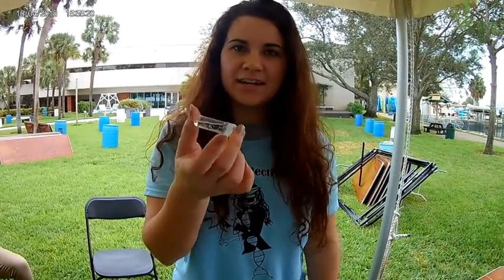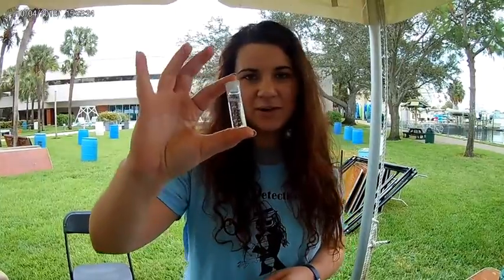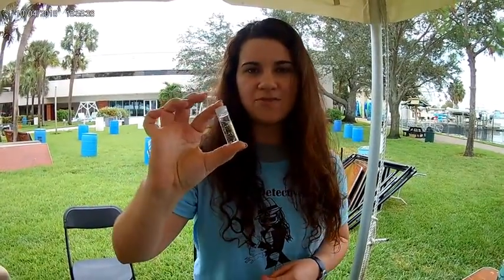Once we have our eggs, what do we do with them? If I can't identify them using their physical characteristics, then we have to use their DNA. Do you know what DNA is? DNA is genetic material that all living things have. And so we can use DNA from each of these eggs to tell you exactly what species or which animal they came from. So that's what our activity is about today. So we're going to go and do the activity right now over in our pool. Come along.